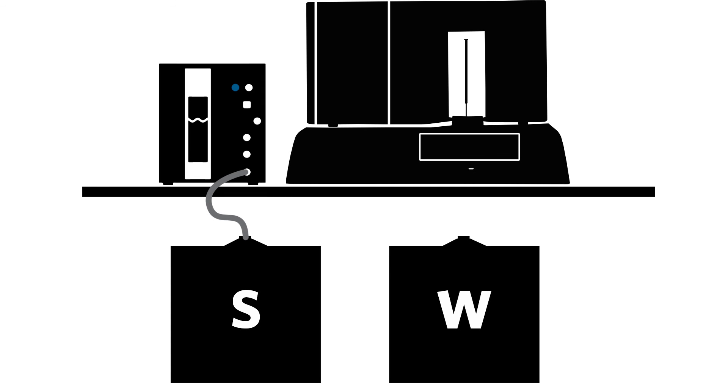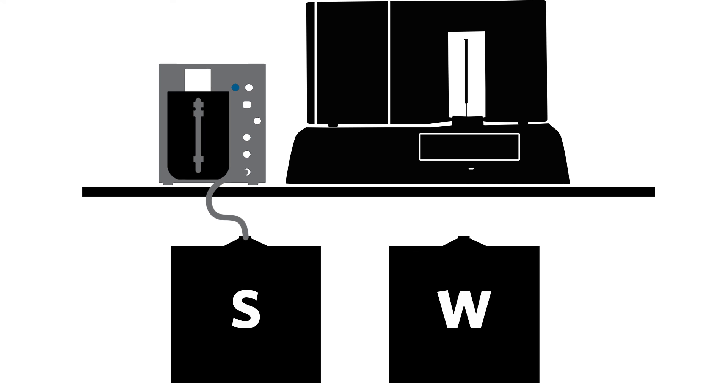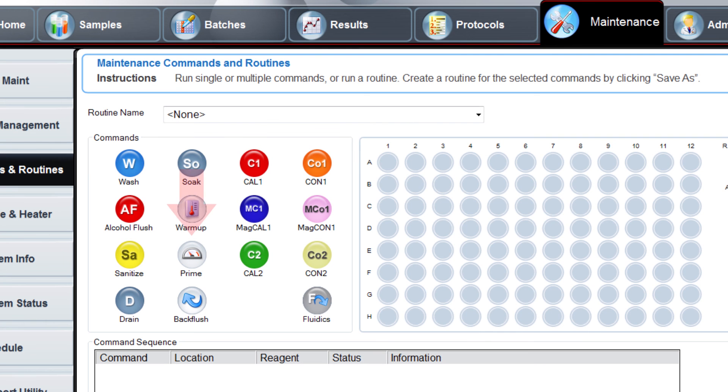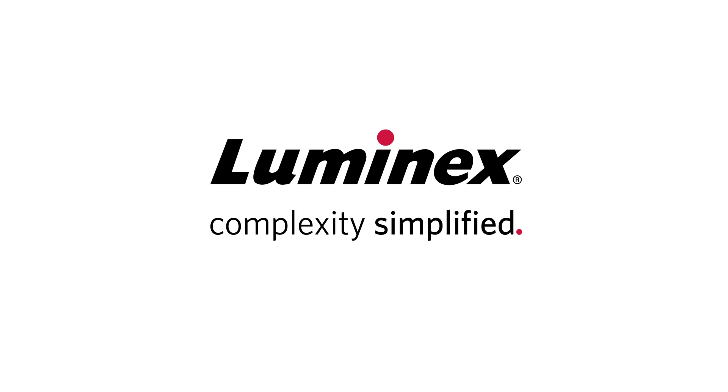Now that you have gone through this video, you will know what to do if there is an audible alarm and fault LED. In addition, you know how to drain, fill, and prime the Luminex SDS. For more information and more videos, please visit www.luminexcorp.com.